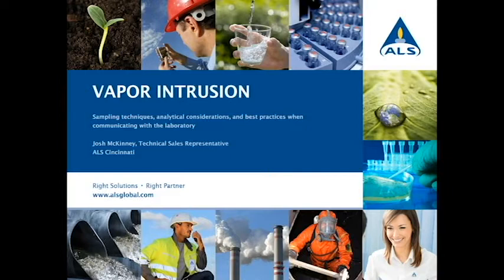What became very apparent to me as I came along here with ALS is there are a lot of variations among laboratories about what type of equipment they supply, and reporting limits, and different sorts of, I guess, accessories to summa canister sampling as well.